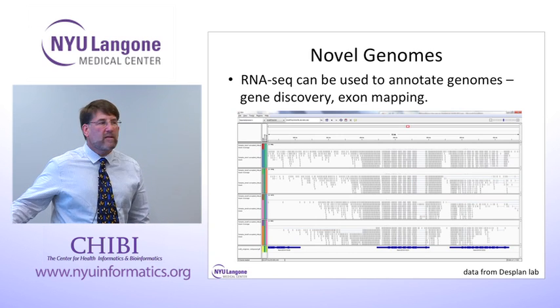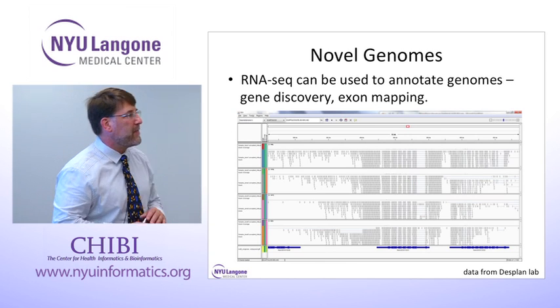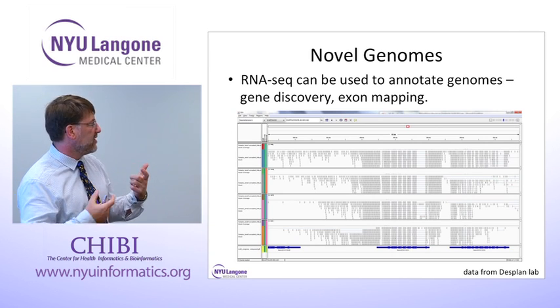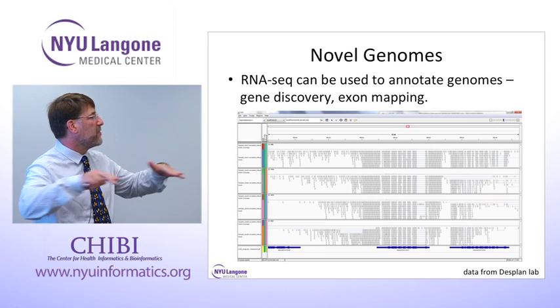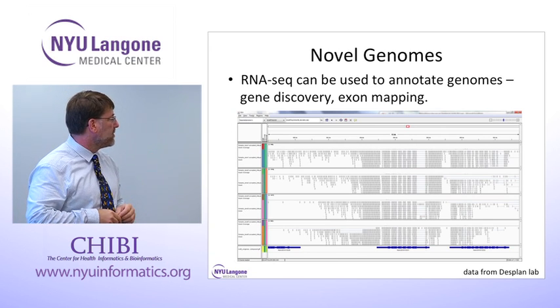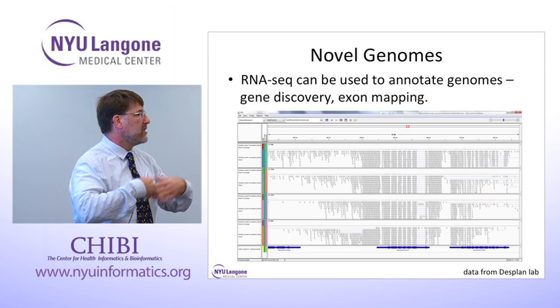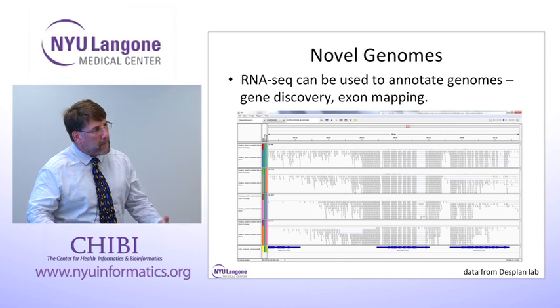And in fact, the transcripts that this builds are not very reliable because it's looking at this overlapping, and there's nothing to prevent it from assembling into one transcript fragments that are actually all parts of different alternatively spliced transcripts, or vice versa, creating alternatively spliced fragments from something that really is one sequence but has a couple of base pairs mutated so they don't assemble well. So it'll give you something. It'll give you a set of transcripts. It'll definitely give you the baseline that you could then use to, say, translate into proteins and get information about the genome of your organism, but it's not very reliable.